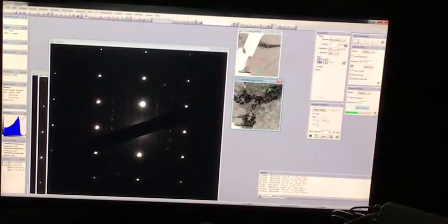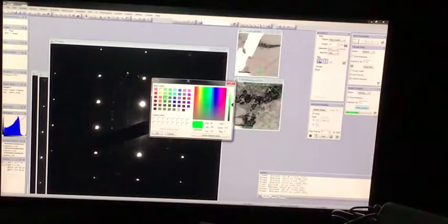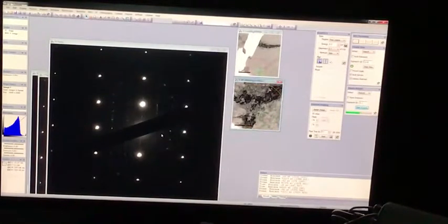It's approximately right. It's just an approximation after all. So that one is red. Set foreground color red. Okay. So that's how these two images are related. So I'm going to save that. Save. Save.